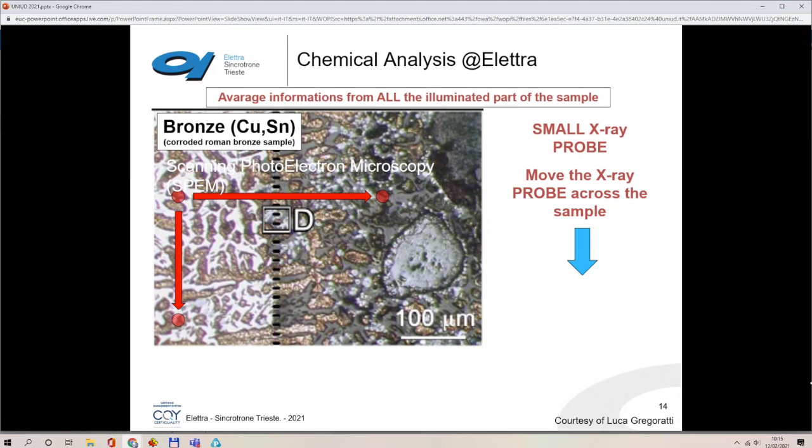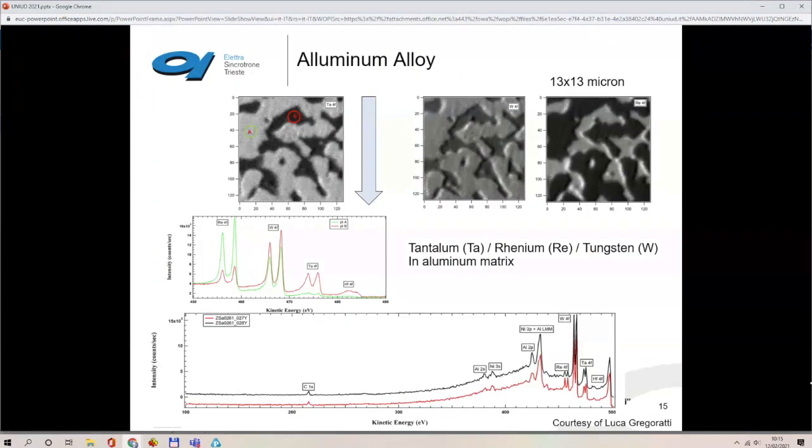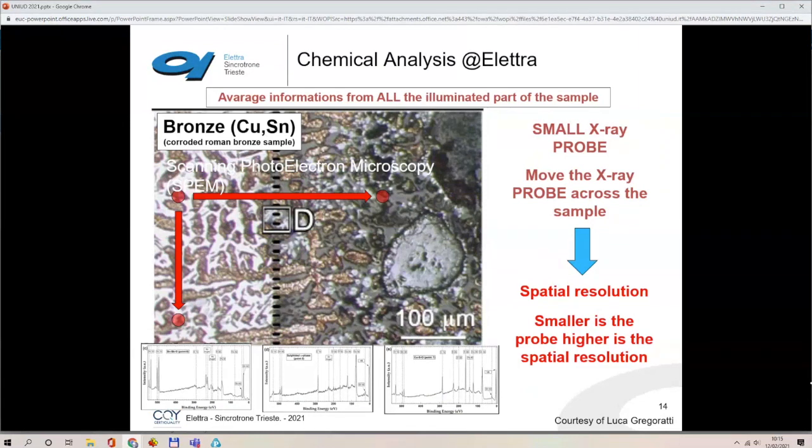And if you go on, Fabio, with the next slide, in this slide you can see the spectrum of each point that is in the upper figure. In the bottom you see the spectra, and the spectra are completely different one with respect to the other, because they reflect the composition of the surface. So what is important is that we can also get spatial resolution. So we can identify the morphology of the surface. And this is very interesting, because we can reach dimensions in the order of hundreds of nanometers. So it's very, very small, and we can understand the behavior of surfaces at very small scale. So please go on.